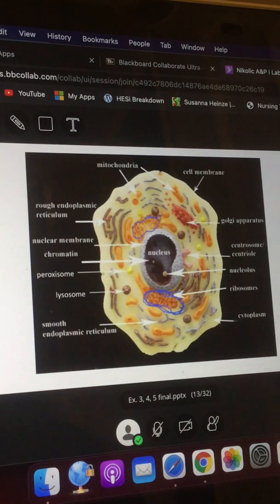Okay. All right, awesome. And then we're going to keep going in mitochondria. Mitochondria, they look like little Cheetos, the Cheeto Puffs. So that's the mitochondria, Cheeto Puffs, right? In other things, they look like beans, but here they look like Cheeto Puffs. Hey, if you can look at that and give me mitochondria if we ask you for it, sweet. Again, spelling counts. That's why you got to write it out, right? There's just no way to avoid writing it out.